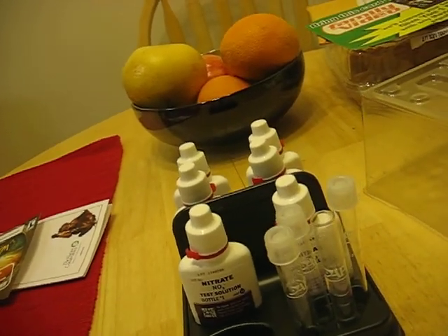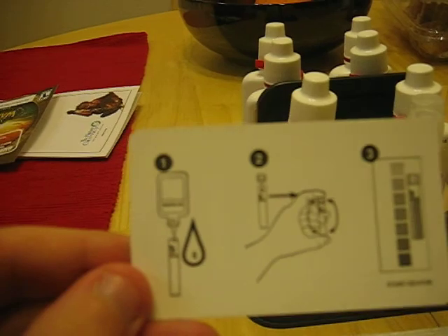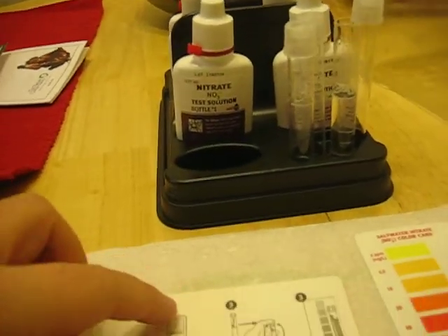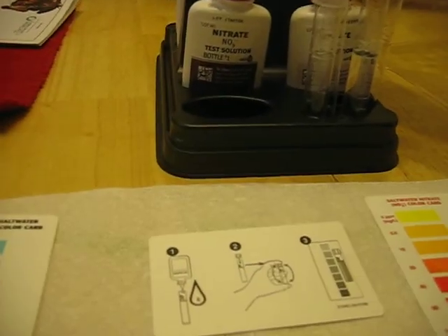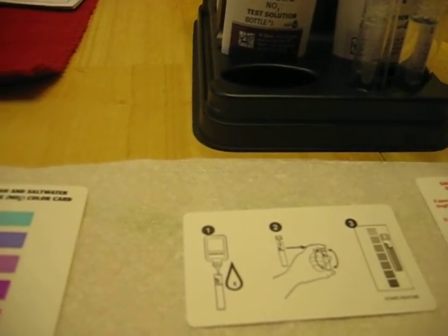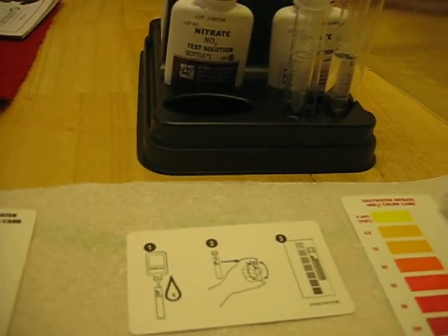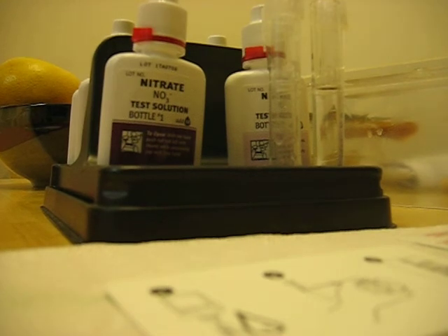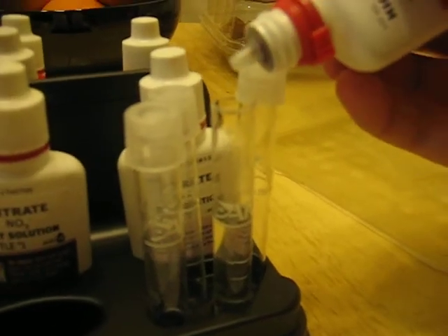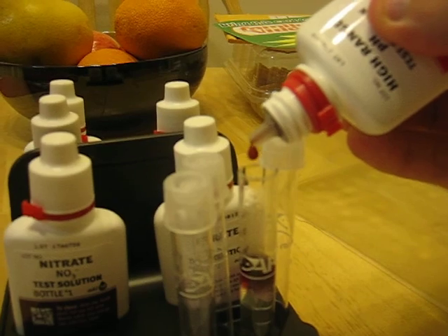We'll do the pH because the pH shows right away and we don't have to wait five minutes, so I don't have to edit or anything. The pH one also says five drops. We're going to do five drops — one, two, three, four, five.